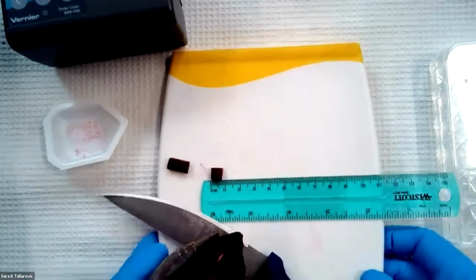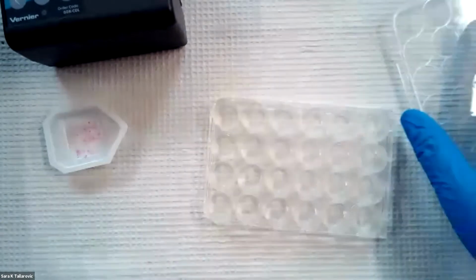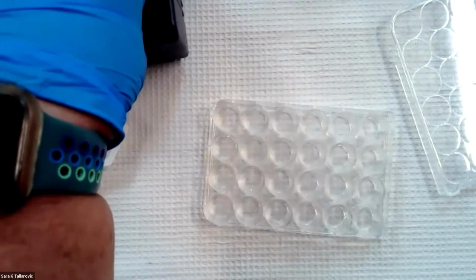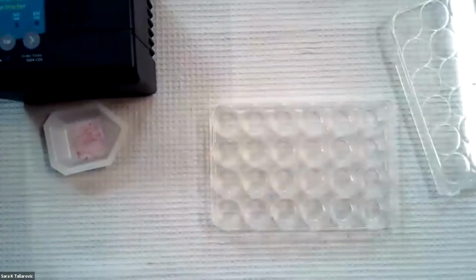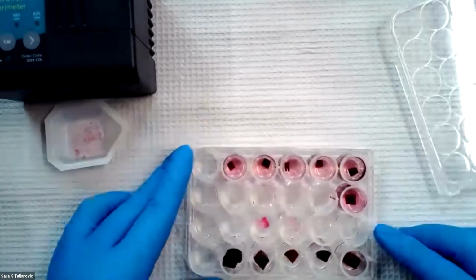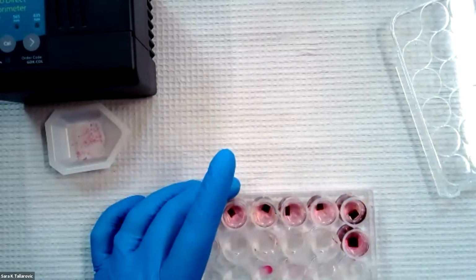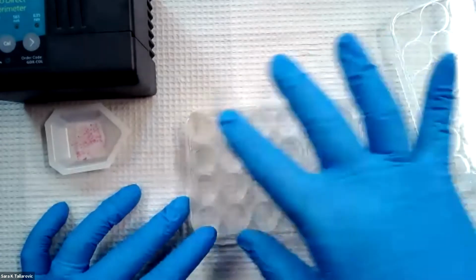And I'm going to switch out here and show you what it looks like to set them up. Now, I kind of prepared this like a cooking show where I've got some samples that are already ready to go. So I started some of these samples already in a micro well plate. And those are the ones that you see along here. So normally you would just drop in a cube of beet into each well, and you would add your solution.